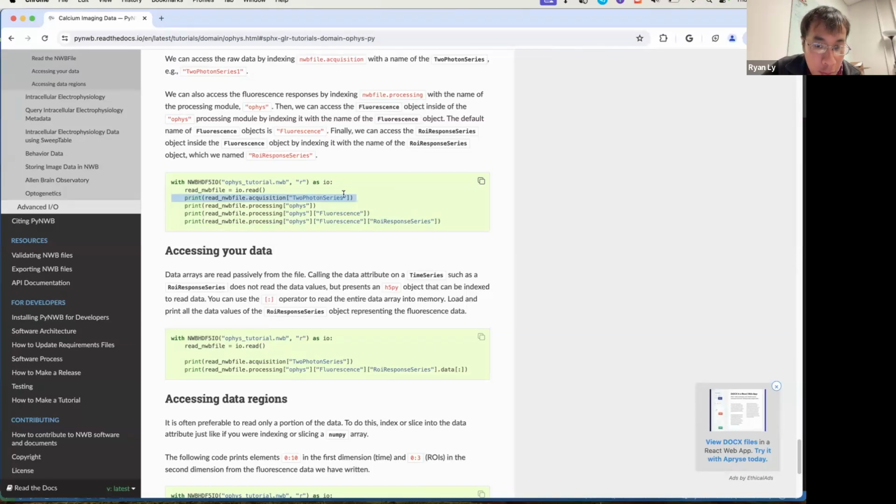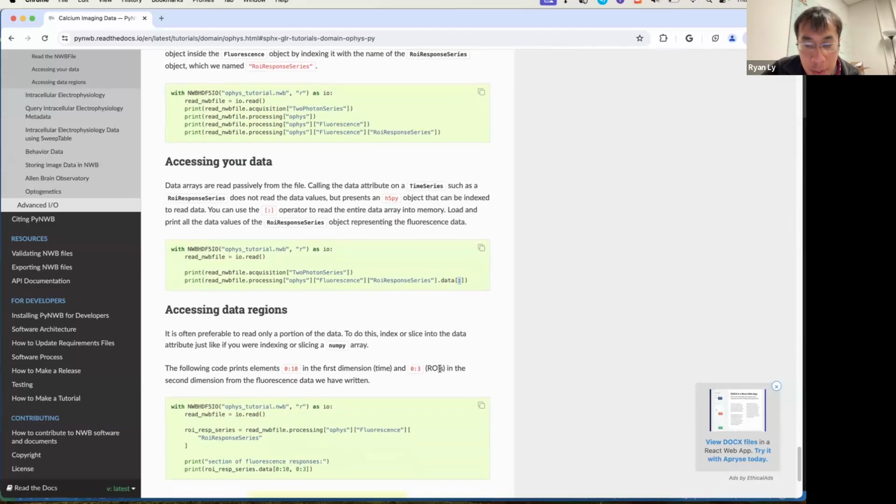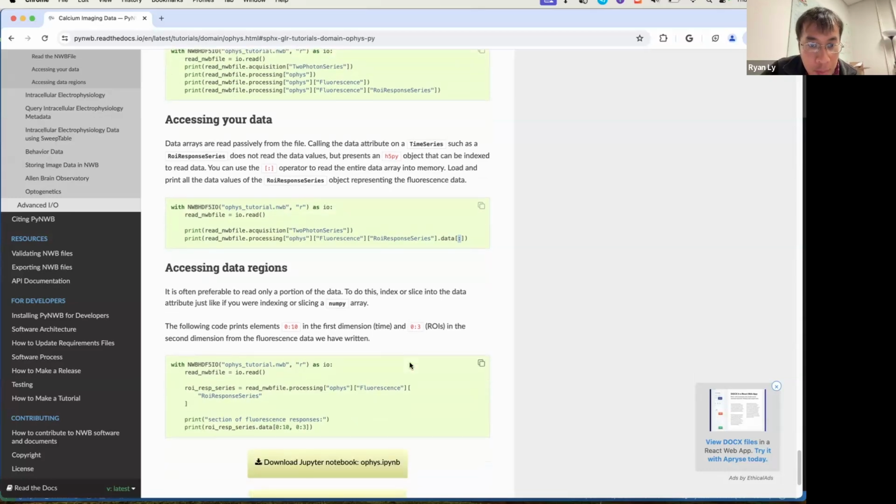If you want to do that, you can call the .data accessor on the object, and then slice all of the values using the colon here to get all the values into memory, or to store it in a variable. Often these data are big, so you might want to index or slice this data array and just get a subset of it. And you can do that using standard NumPy array slicing syntax.